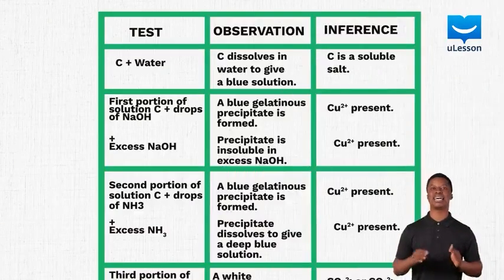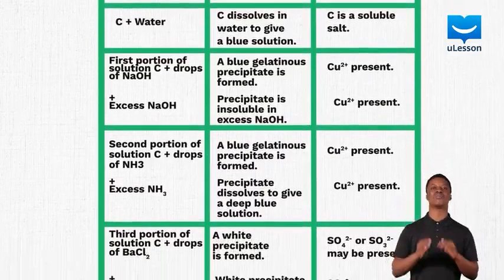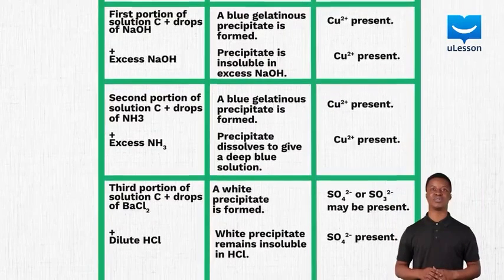Here is a table that details the tests, observations and inferences deduced in our qualitative analysis of copper 2 tetraoxosulfate 6 solution.